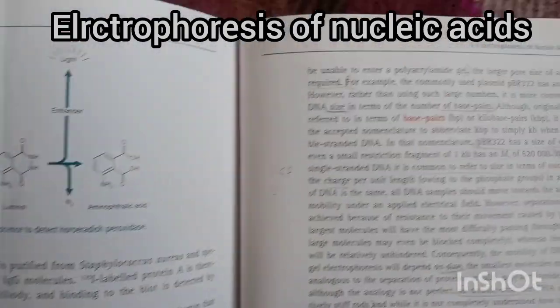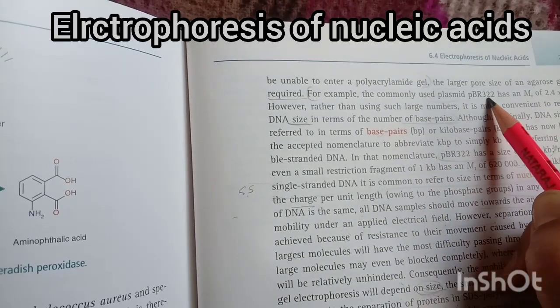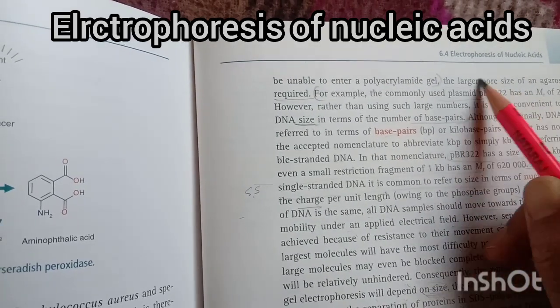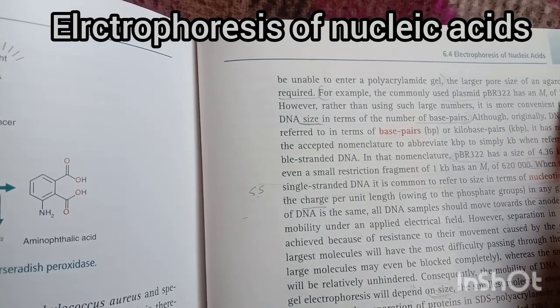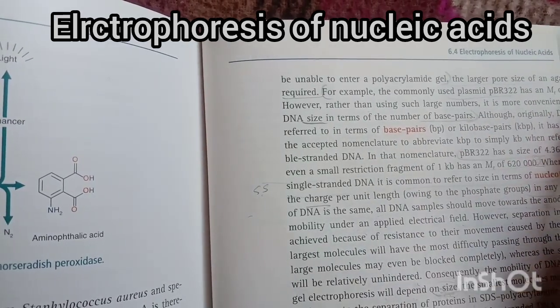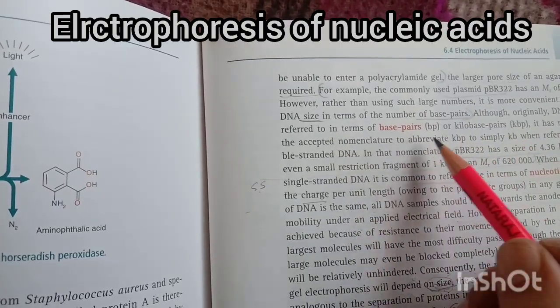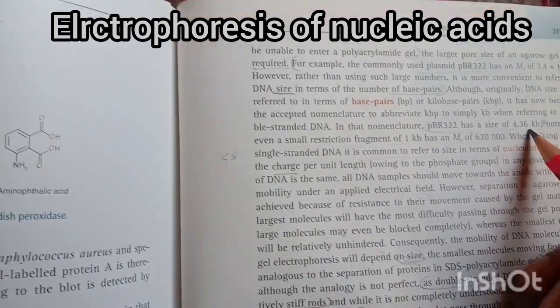For example, we have the plasmid pBR322. Its size is Mr 2.4 × 10^6. So if we talk in base pairs, it is about 4.3 kb.